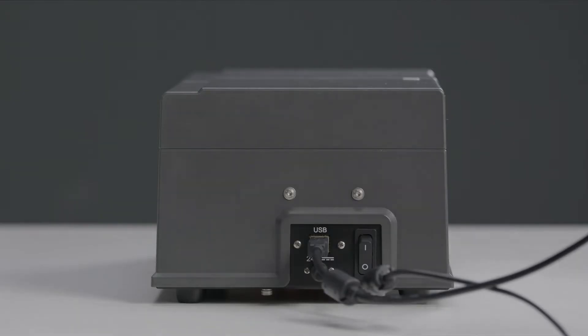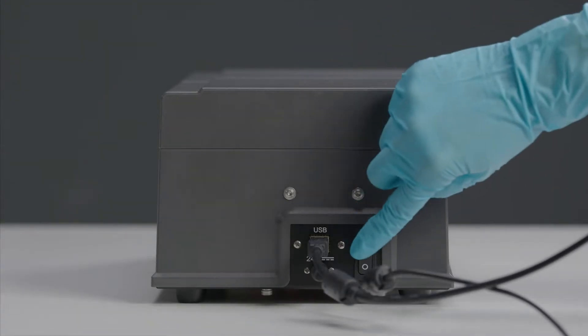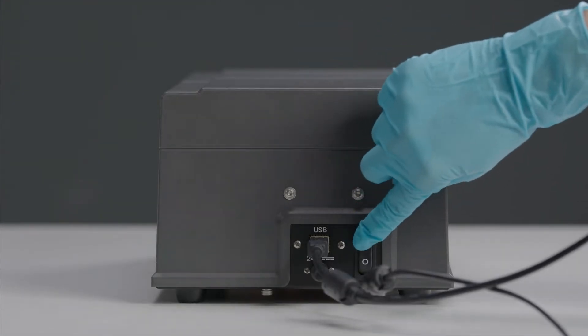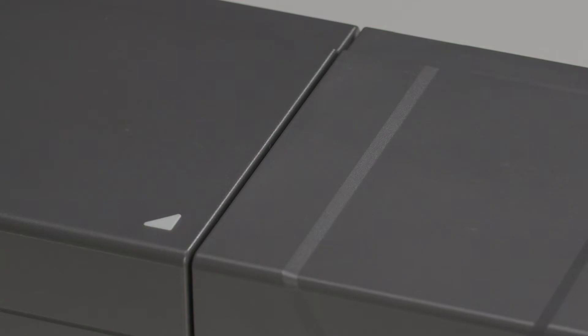Turn on your instrument with the power switch. The green blinking light indicates that the device is now ready to connect to a PC.